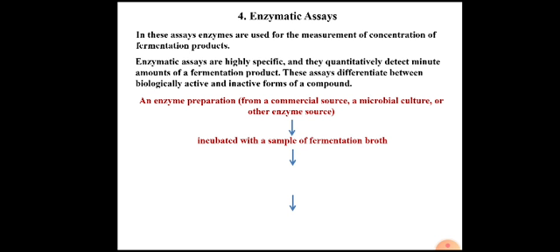under standard conditions, is incubated with a sample of fermentation broth. This fermentation broth may contain a mixture of compounds, but these enzymes are going to recognize or bind to only the specific fermentation product of our interest. So for that, the enzymes are incubated with the fermentation broth.